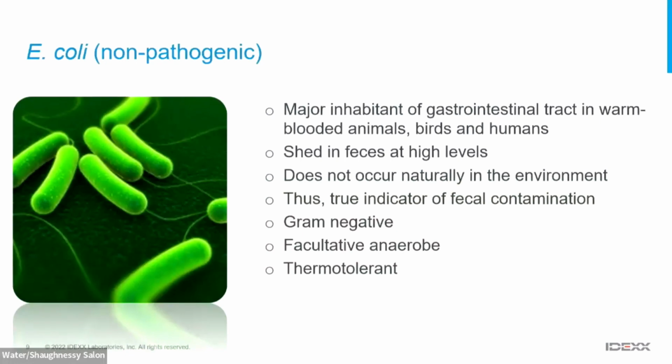Cool. All right. Now actually getting to the test methods. So we know what we're looking for. We're going to look for coliforms. We're going to look for E. coli, and how do we do so? So how many people here are actually doing testing in the lab? Okay, quite a few.